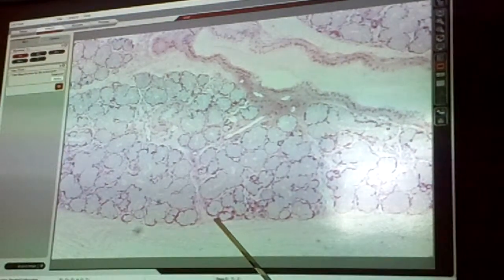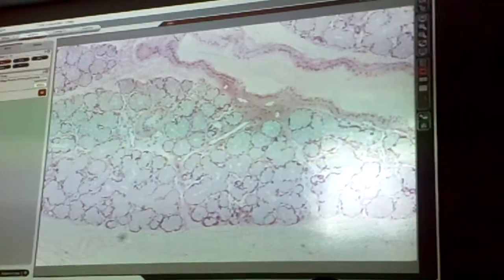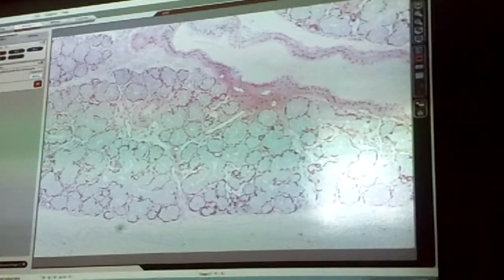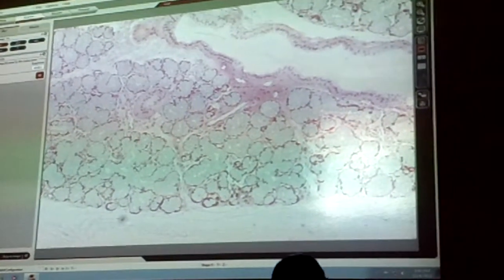One might be one that needs to be on a larger than the minimum objective to see the structure. I think what students may like to do is look at the microscope and go, that's high objective, I can see that. Look at the paper. You can't do that. It doesn't work that way. All right, one more of these sublinguals, and we'll move on to the tongue.